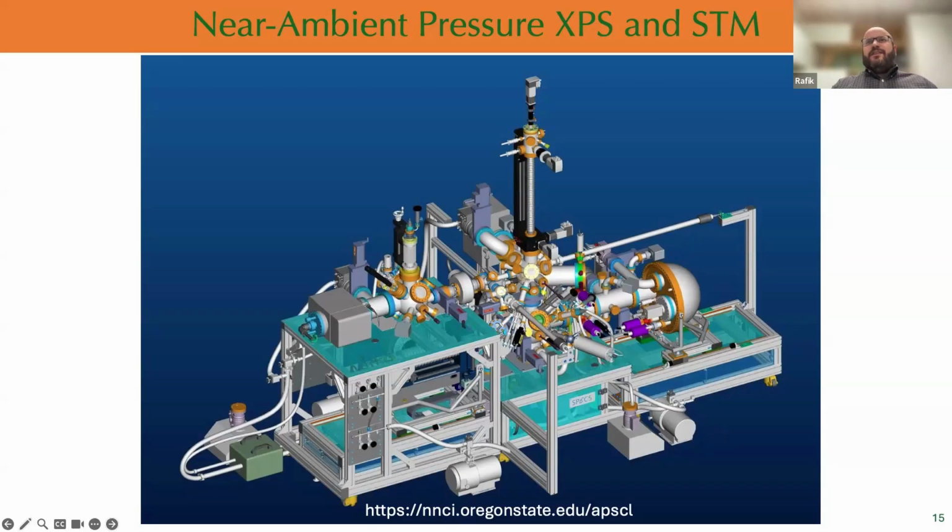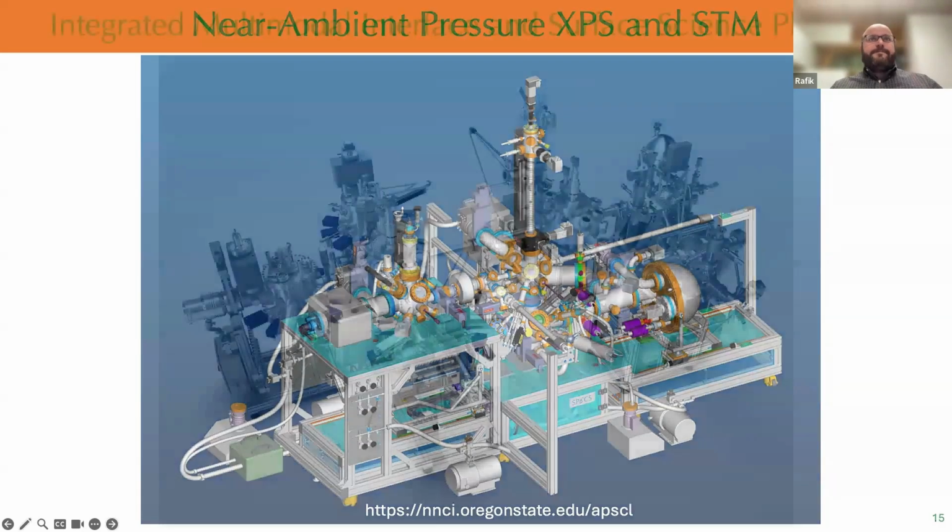As you can see, the detector is here, but the cell where we hold the sample is here, and we have 3 different differential pumping stages, because we are going from, sorry, I said 10 to minus 4 millibar, no, up to 10 millibar. We work at 10 millibar. So we go from 10 millibar to ultra high vacuum through these 3 differential pumping stages.